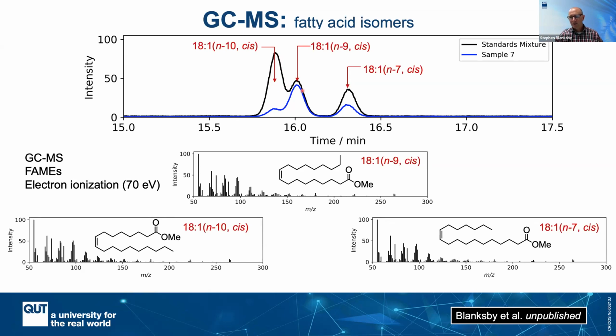In cases like that, with GCMS, what we would conventionally do is go to the mass spec dimension and look at the differences in the mass spec and do extracted ion chromatograms. And here we hit the snafu that the electron ionization mass spectra of all these fatty acids are identical. So really for GCMS in its conventional form, we're very much just relying on retention time to assign identity. And this becomes problematic in terms of discovering new fatty acids or new smaller lipids, because we really don't have a detailed structure elucidation dimension coming from the mass spectrometer, even though the GC is, as I say, gold standard in terms of separation.